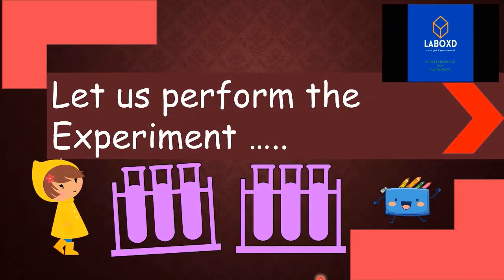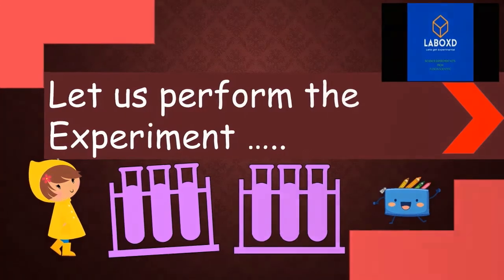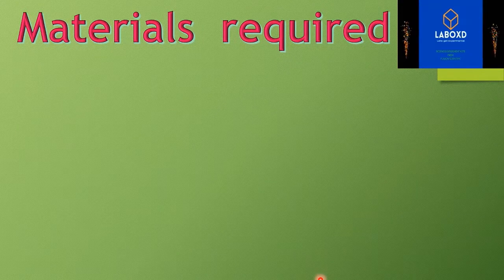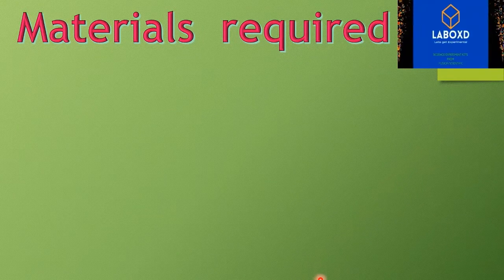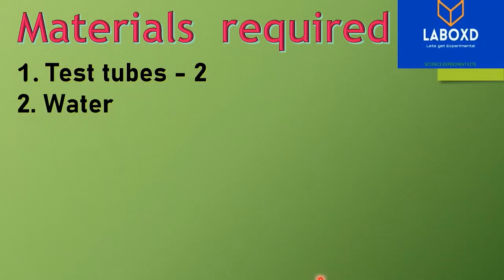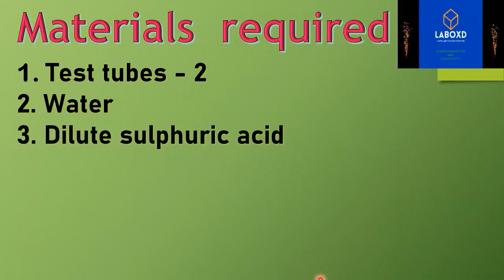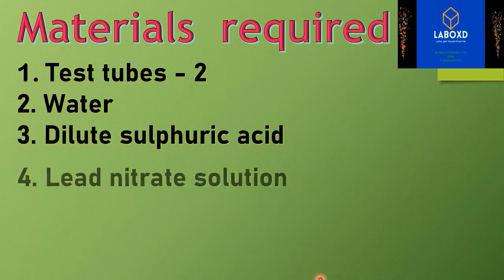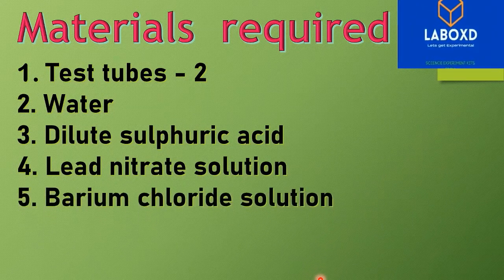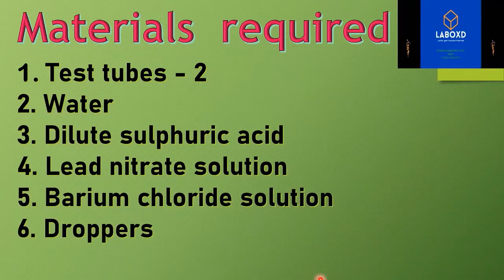Are you ready to perform the experiment? Let us perform the experiment. The materials required are 2 test tubes, water, dilute sulfuric acid, lead nitrate solution, barium chloride solution, and droppers.